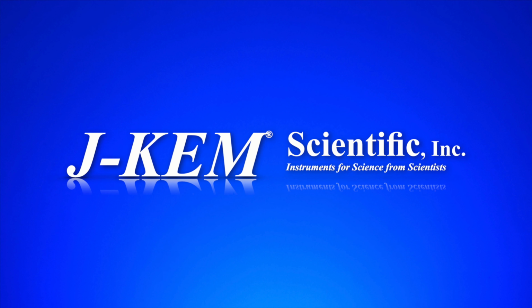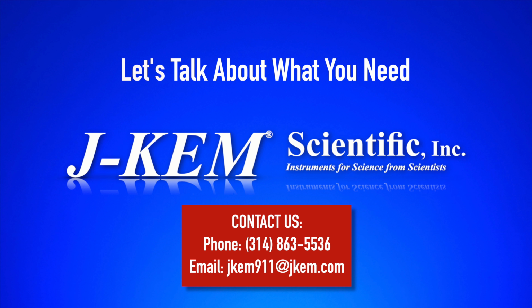All of the products we offered really resulted from a conversation with a researcher who called us, who had an idea, who needed an instrument. And there are so few companies anymore that will talk to that person, that a researcher can call and talk to an engineer and say, I need one of this. I need this instrument to turn that on, to do this. I need one. And J-KEM is that company.